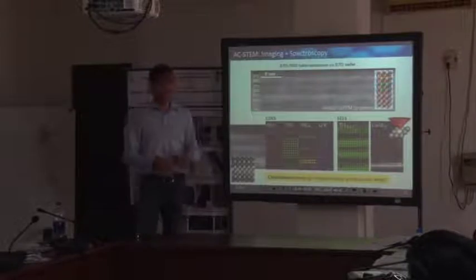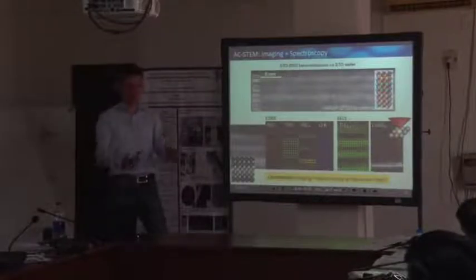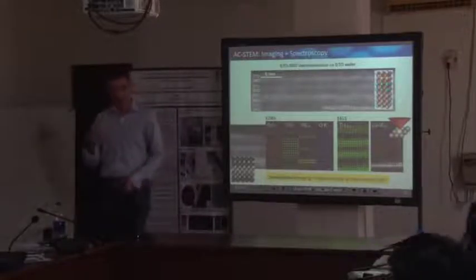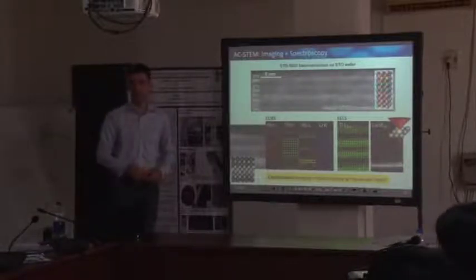If you're interested in a larger area, you might just illuminate that and measure your outcoming and generated X-rays. This is what you can always do just for a rough measurement. But if you want to do some site-specific measurements, it's always easier to address that in the STEM mode.